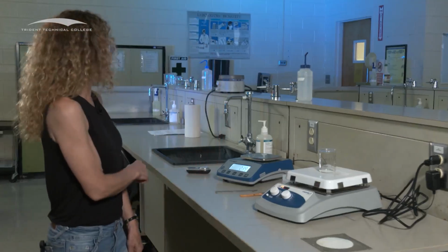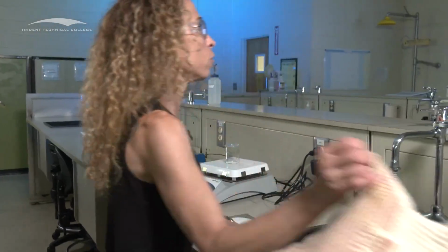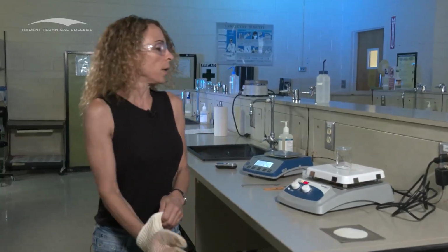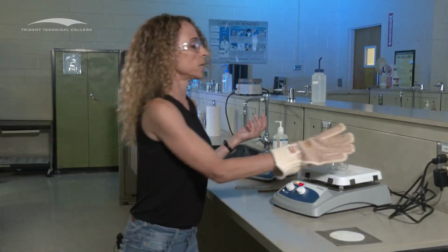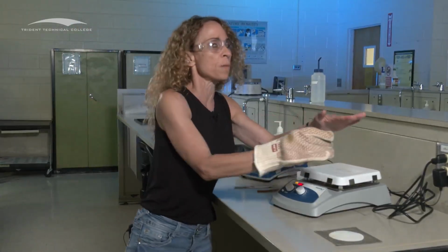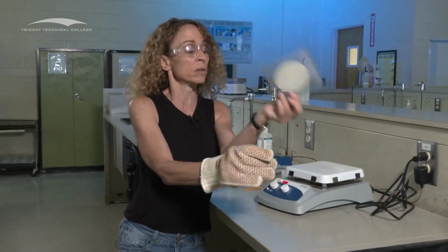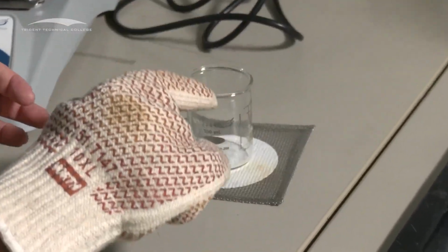But what you have to do here, if you touch this beaker, you're going to burn your fingers. Don't do that. So you can use an oven mitt, which we have right here, or you can use beaker tongs, which are in the lab as well. But you do not want to use your hand unless you want to burn your hand. Don't do that. Take it off. And now don't put it directly on the bench top. You're going to put it on this wire gauze. Put it on there, let it cool, okay?